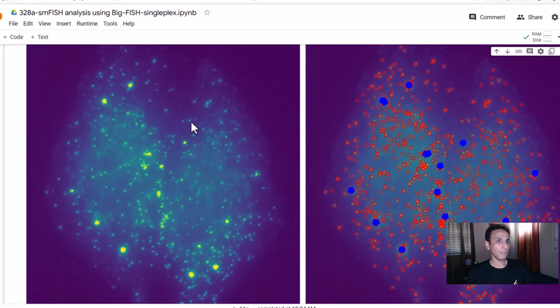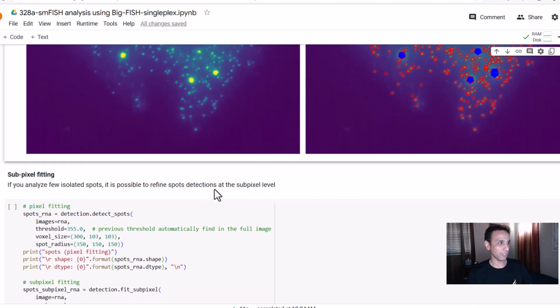Okay, so there you go, and you have all the spots, and wherever you have these clusters, you have this polygon shape filled with blue. That's a cluster right there, right in the middle. So we have multiple such clusters. Again, that's another useful piece of information.